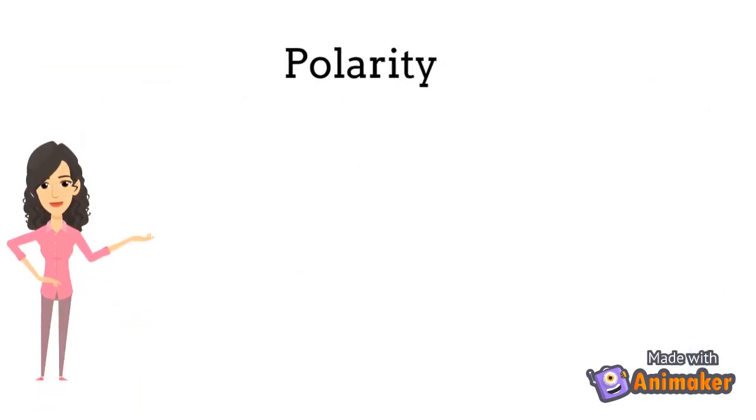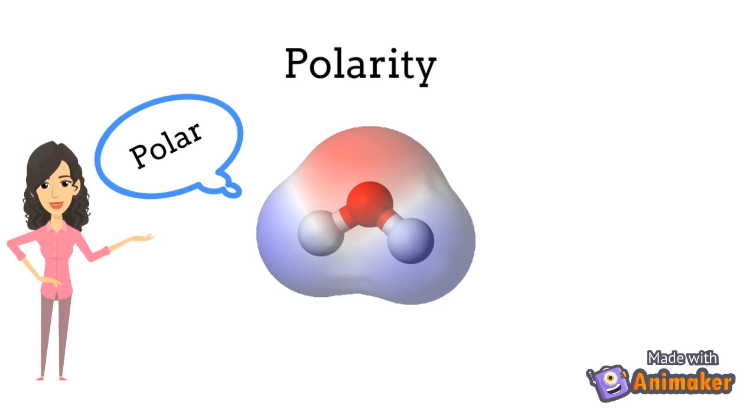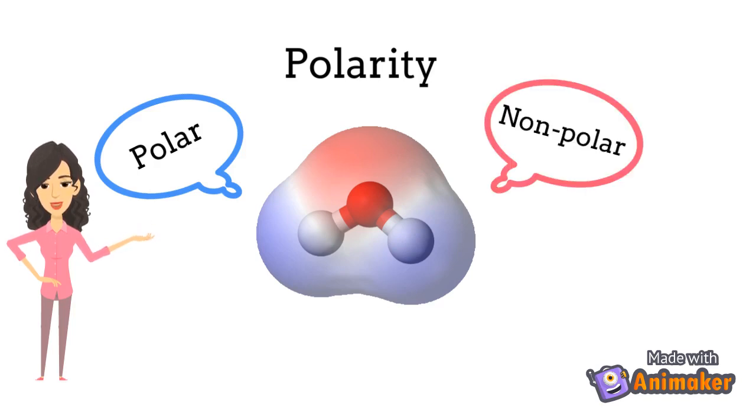In general, polarity is the primary characteristic of compounds that can be used to create reversed phase HPLC separations in a mixture. All components in a mixture have a unique behavioral characteristic related to their molecular structure. They can be described as being polar or nonpolar.